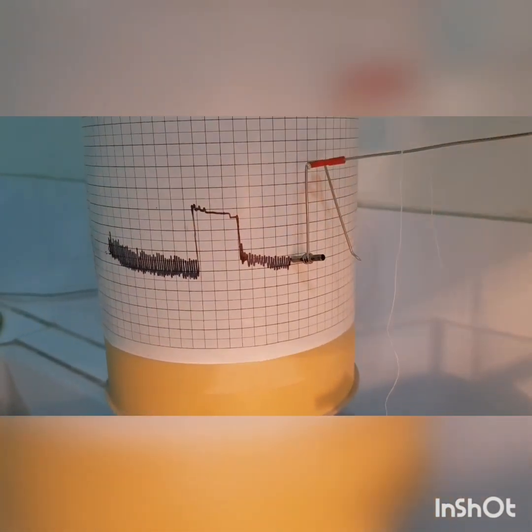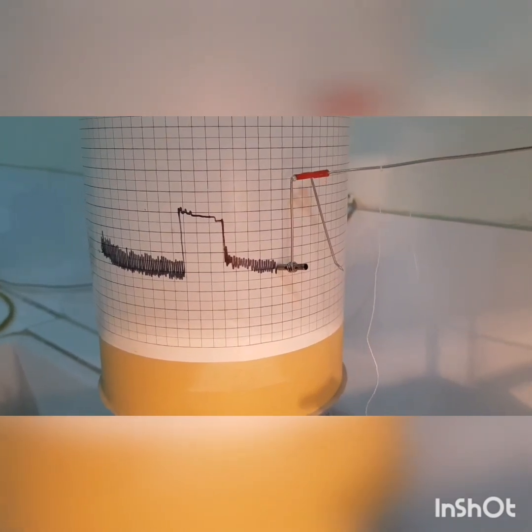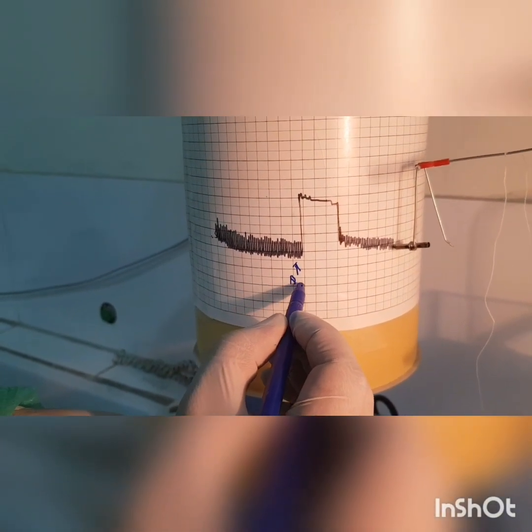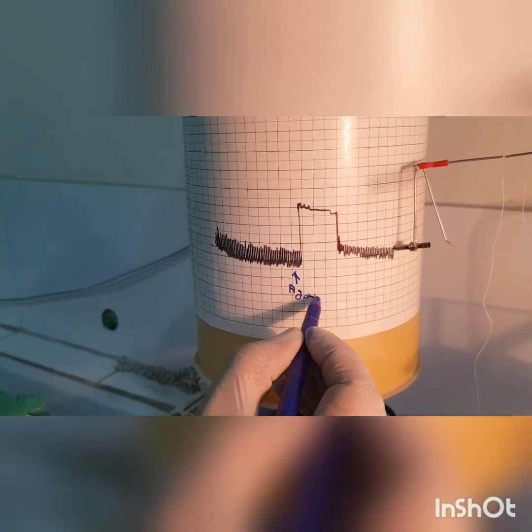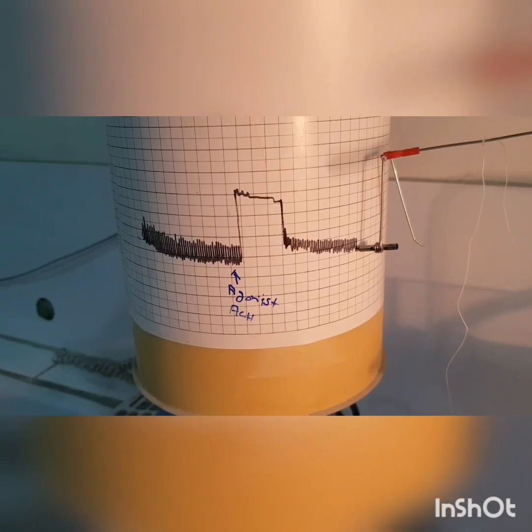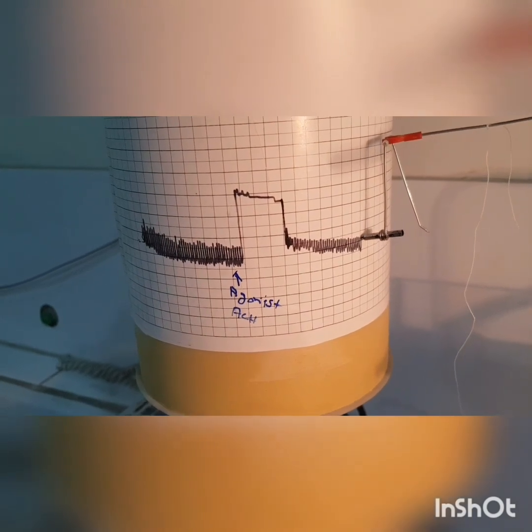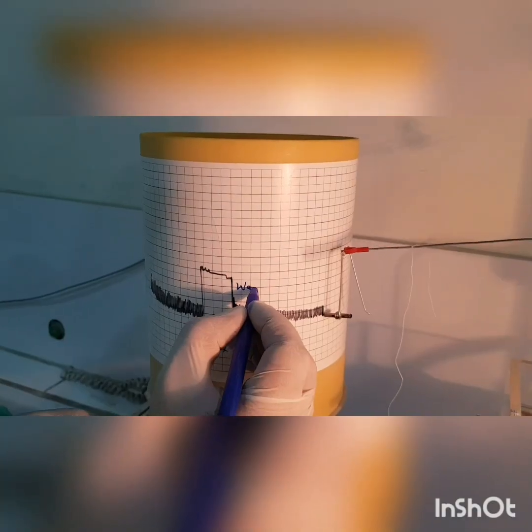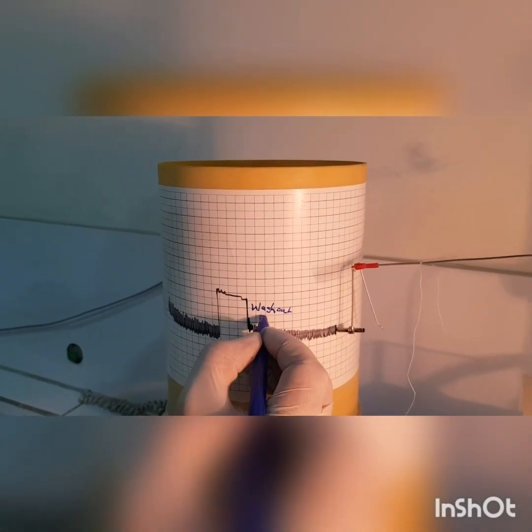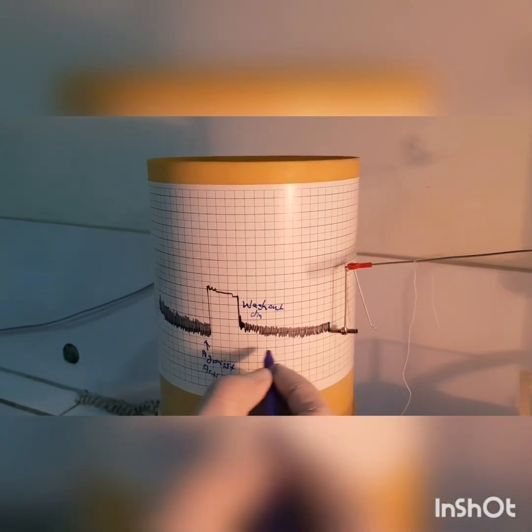Again there is normal contraction. Here first we give the agonist, which is acetylcholine. Then we wash out the drug and repeat the procedure 2 to 3 times.